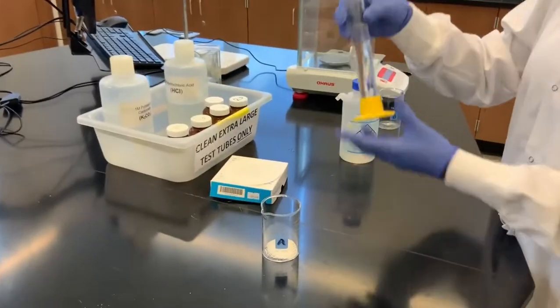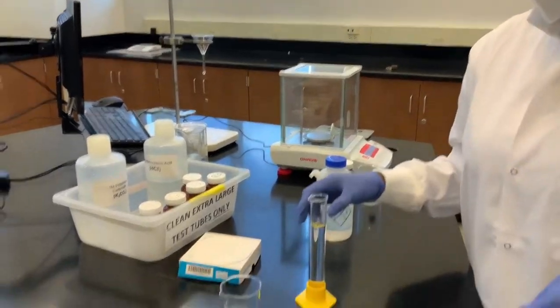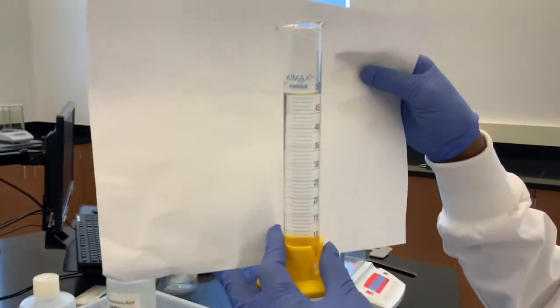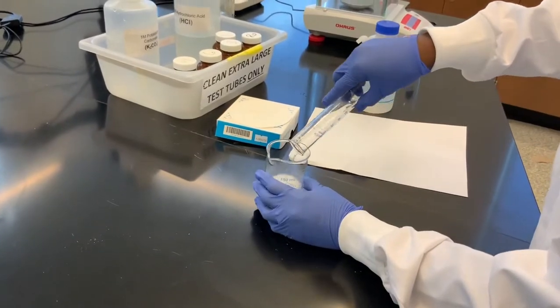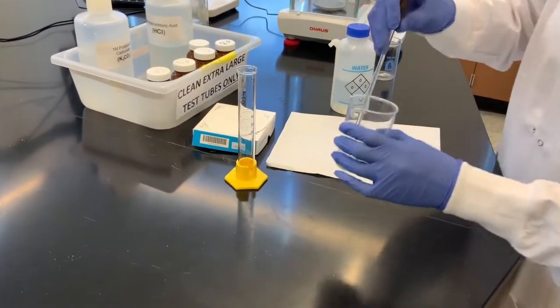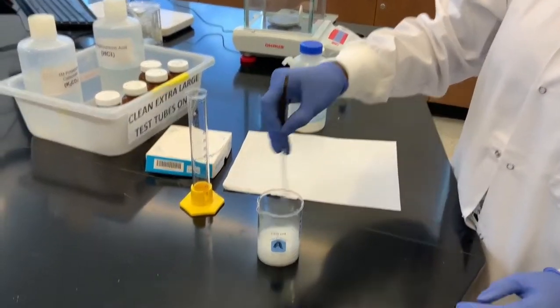It doesn't really have to be exact. How much water you take doesn't really affect the measurement. So this is about 50 ml of water. I'm going to pour it in here and stir it very well, as you can see.